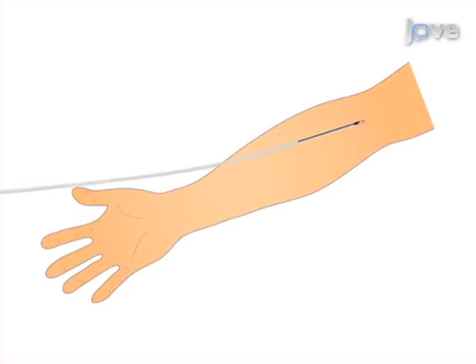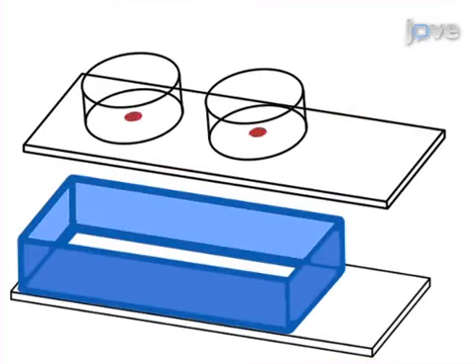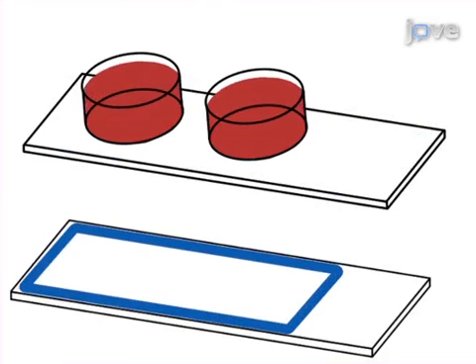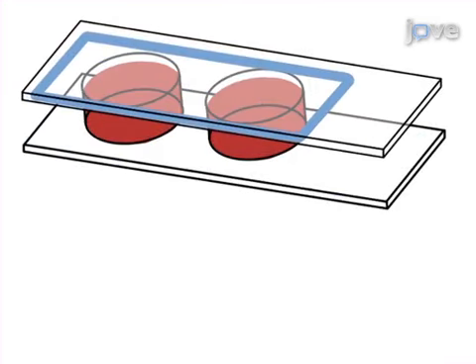This is accomplished by first collecting blood from a healthy volunteer by open-system venipuncture. In the second step, the blood is carefully layered onto heparin surface-coated blood chambers coupled to endothelial cell culture-plated slides.